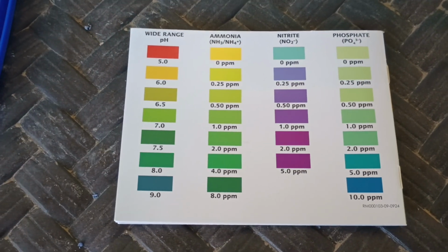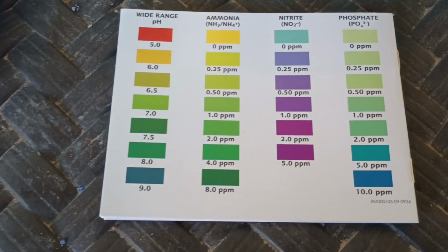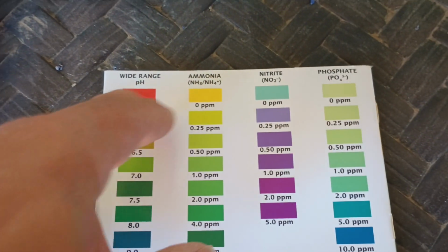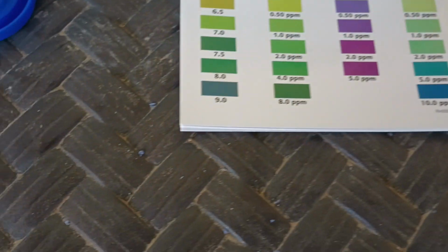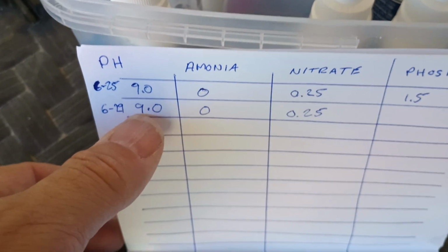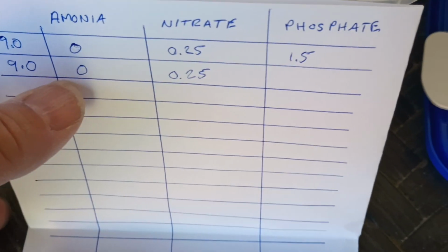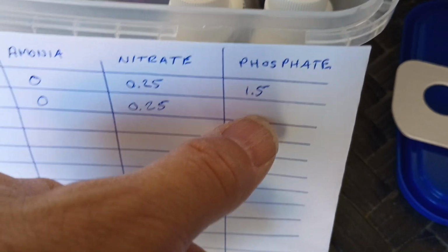So most people would say there's 22 fish in there. That's way too many fish for 150 gallons. But you can see the ammonia is good. And we'll see how that new homemade filter I made works. Here's what I got last time when I wrote it down. Same thing, 9, 0, 0.25, and then I need to write that. This time I saw like a 1, maybe a 1.5.